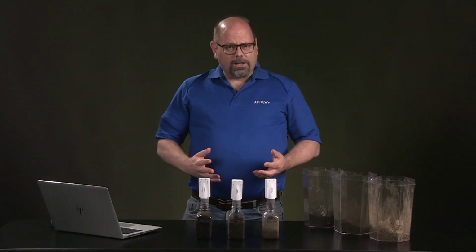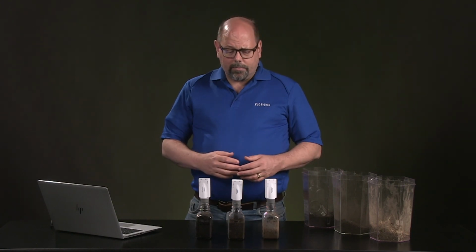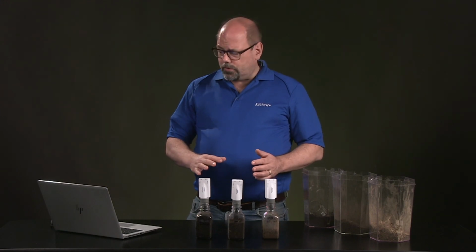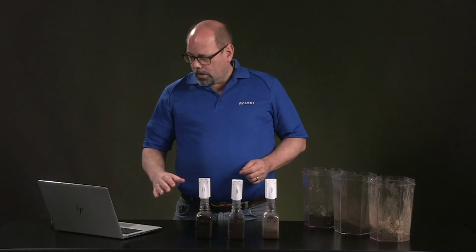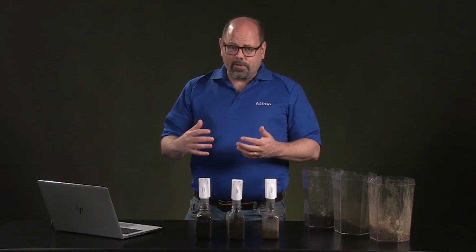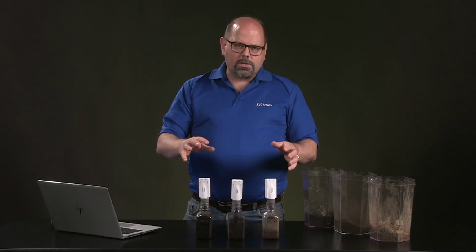Now that you've finished collecting your data for these experiments, make sure that you've collected all of those. You've turned now the runs to be showing that we have. We've also gone and expanded in the bottom of the tools. We've expanded the data so it fills the screen. I've gone through and labeled each of those graphs, because sometimes it'll be confusing to say which type, especially if you're using the same instruments in 3 different conditions.